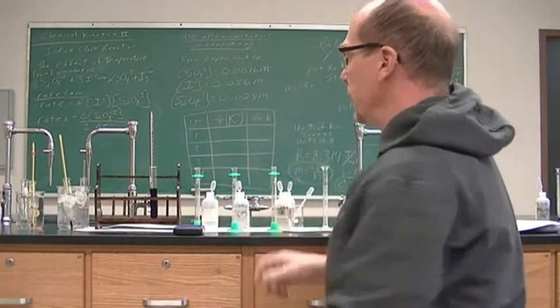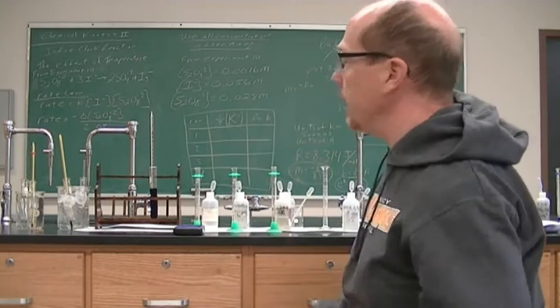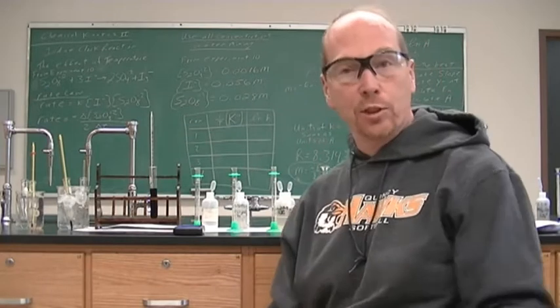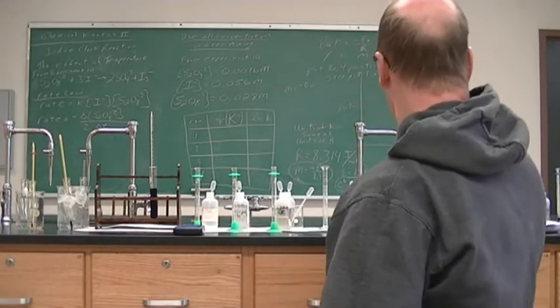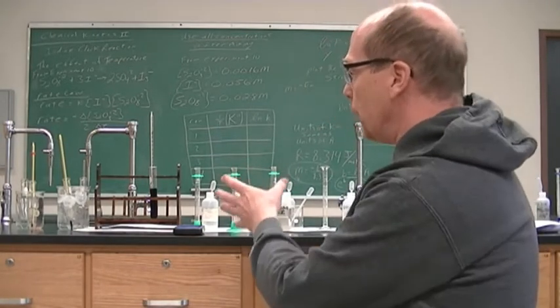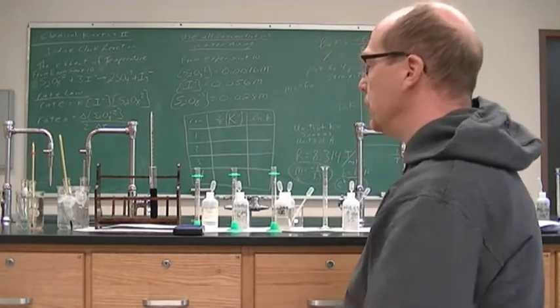Alright, and so that was the exact same reaction that we did for run 1 in experiment 10, which took exactly 1 minute, and then we said 46 seconds, but I knew it was about a second off. And so we have our reaction. It is at room temperature. Today's room temperature is 22 degrees Celsius.